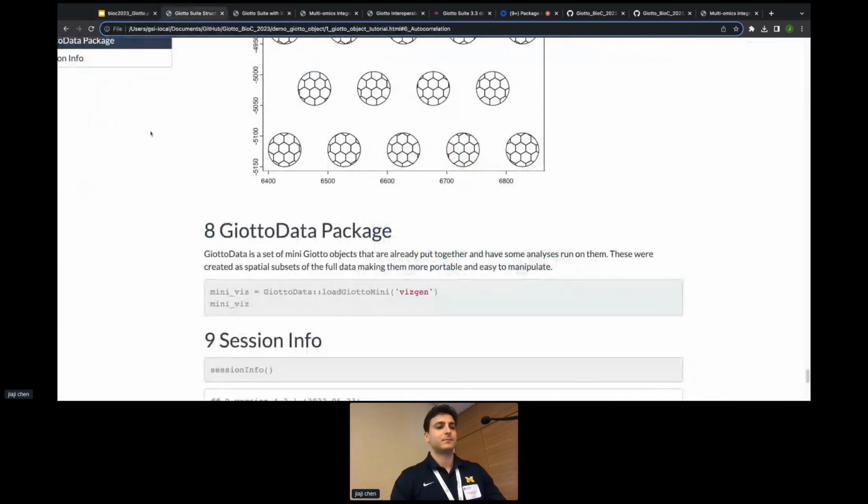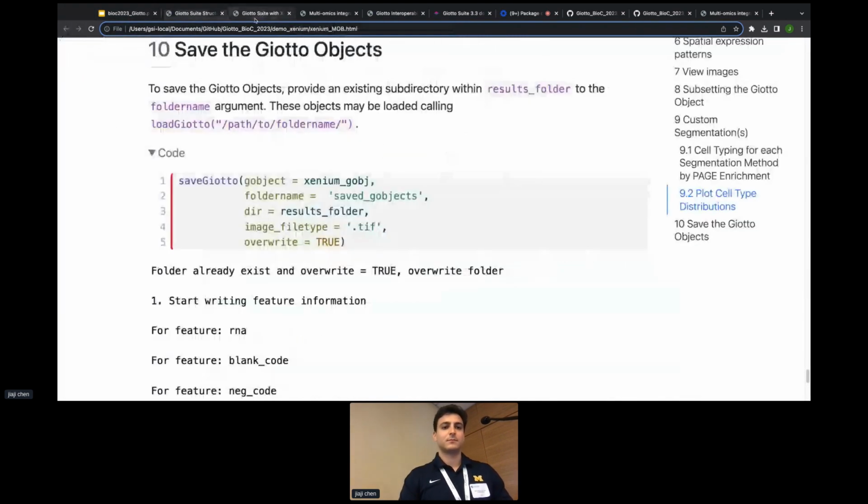Sure. So Ludwig Geislinger asks, it seems difficult to provide general infrastructure for the variety of spatial omics technologies while at the same time aiming at being technology agnostic. Which approach has Giotto taken to be technology agnostic? Does that mean you have specific functionality in your package that applies only to Visium as opposed to other functionality that applies only to Merfish?